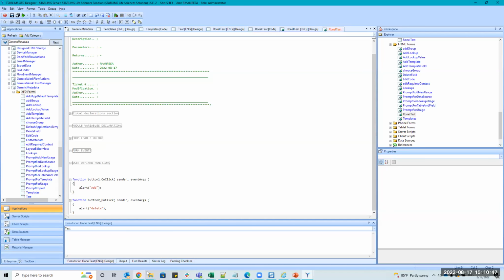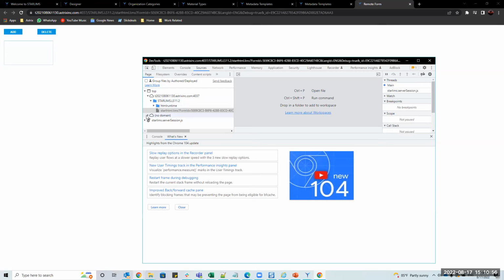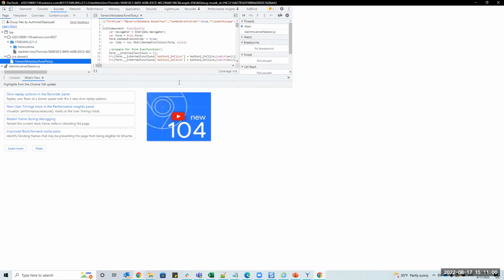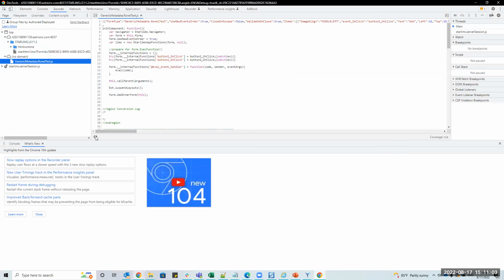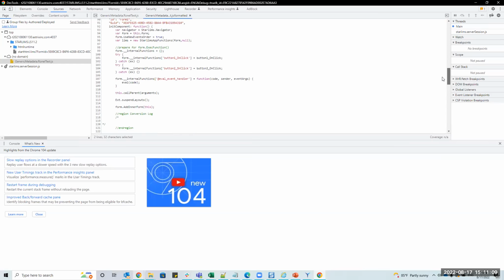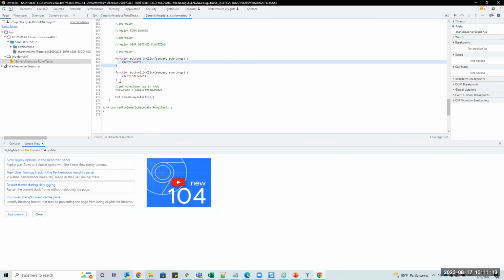and HTML in the browser, right? So when I run this, if I hit F12, you can see that this is just running a website, right? So there's my .js, and here we have the application itself, and there's my source code. So for example, I could step through this.